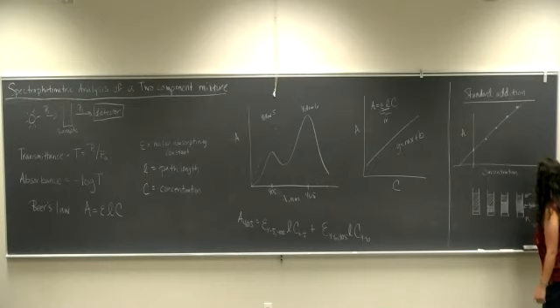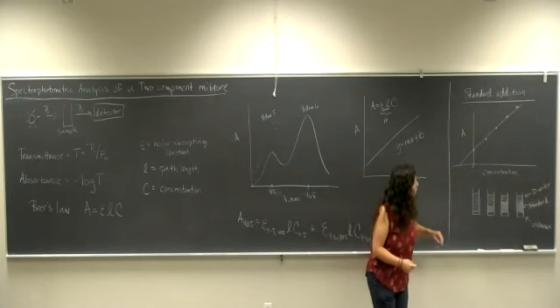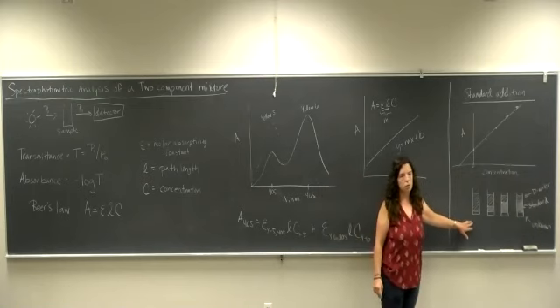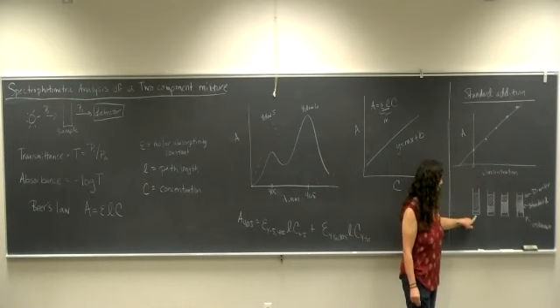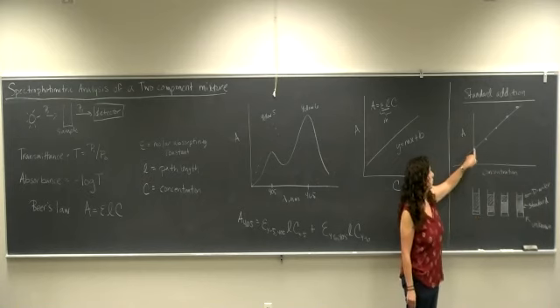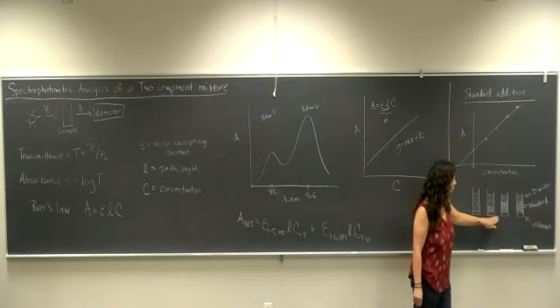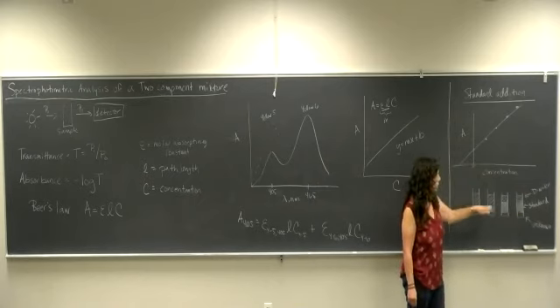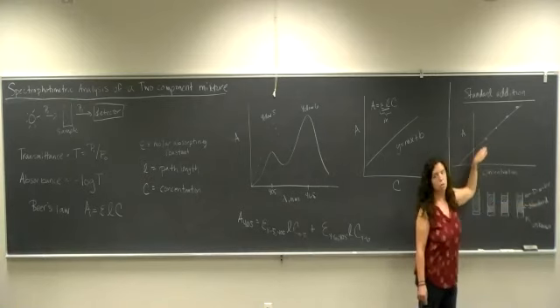And then you'll have some DI water to make up the volume, so they're all the same. And so in this instance, your calibration curve is going to look a little different, because when you have 0 standard concentration in there, you're actually going to get an absorbance because you have some of your unknown in there. And so you'll have the same amount of unknown in all of these. You're varying the concentration of your standard. So you can construct a standard addition plot like this.